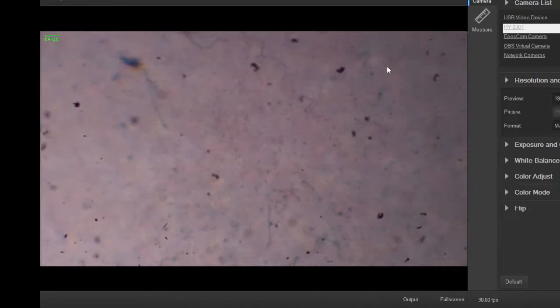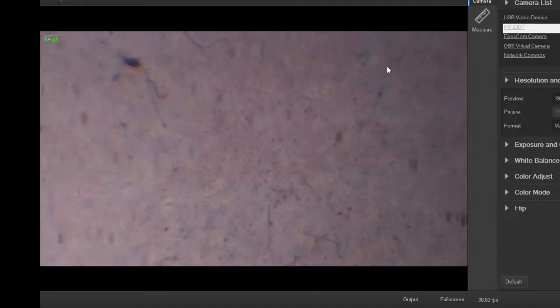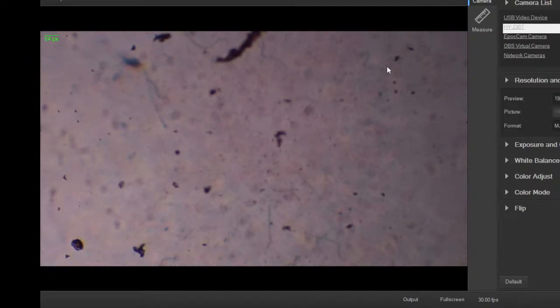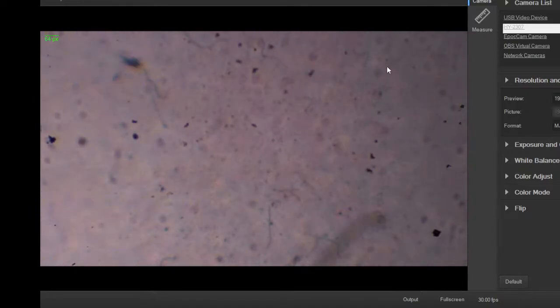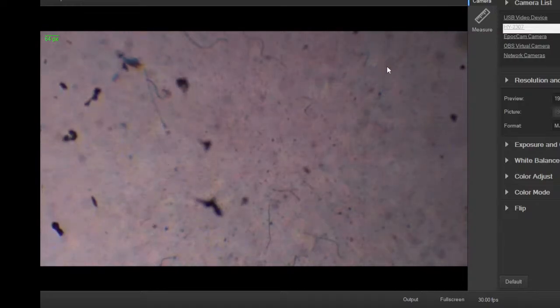Clusters of dead plant material, stuff like that. A nice little sheet of cells from probably a leaf. Not getting too close, I'm just looking for moving stuff right now. Spot on there. I gotta get that off. That's not a good spot. But no time to clean it now. That's an interesting little cluster of cells there. Maybe we'll check on that.